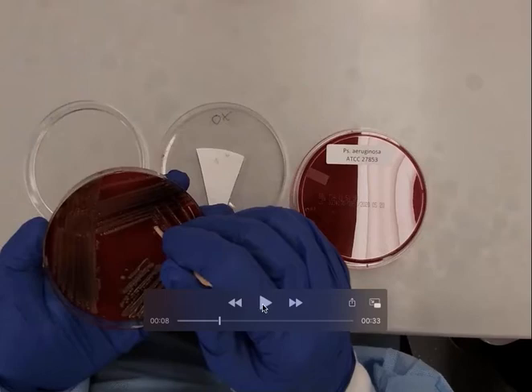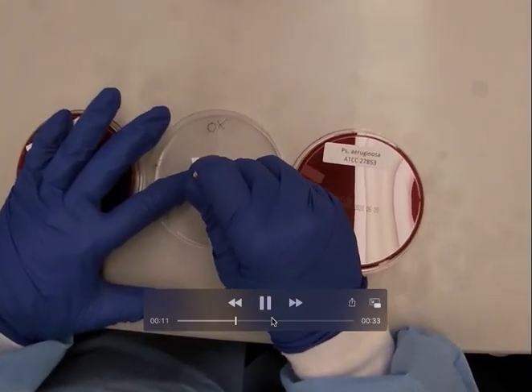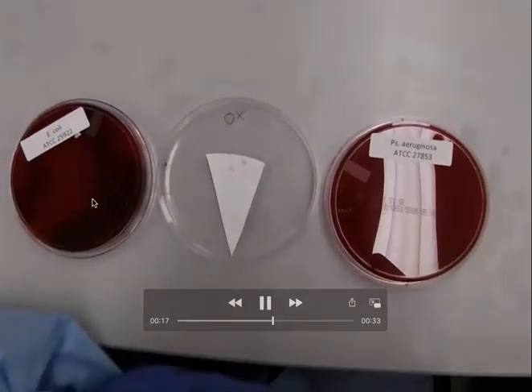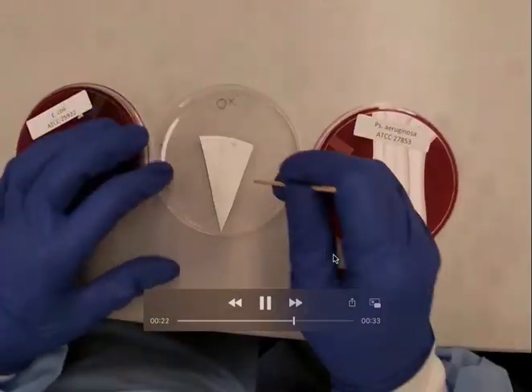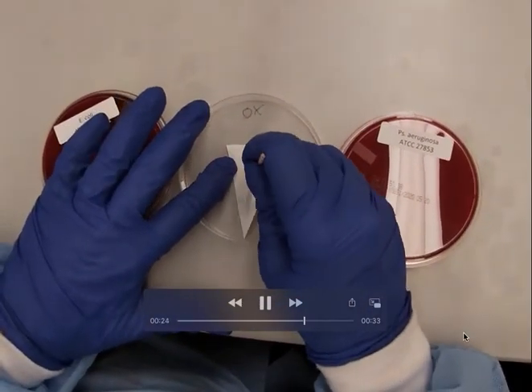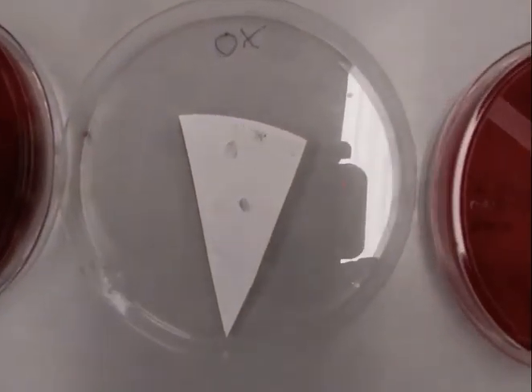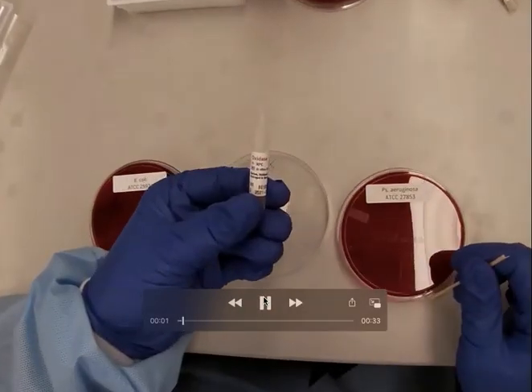What you do is take your stick, get a little bit of the colony, and smear it on the oxidase paper. You can see that is a negative result — there's no color change, just pigment from the E. coli. Now we're using Pseudomonas aeruginosa, and you can really see the color change. You can definitely see the difference between Pseudomonas and E. coli.